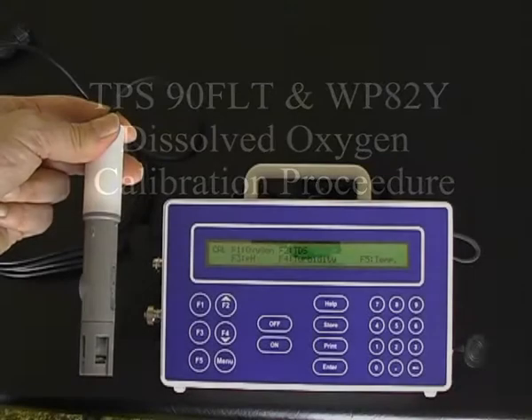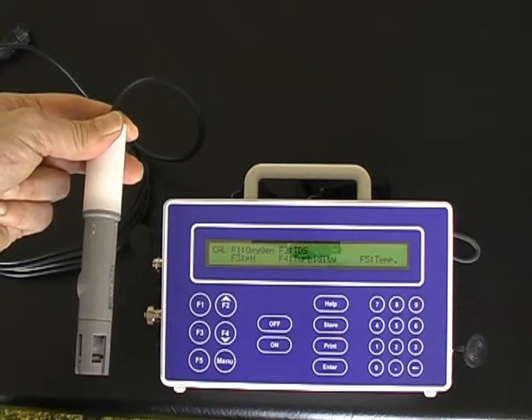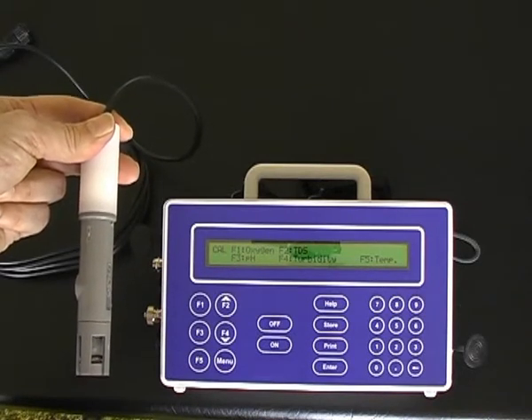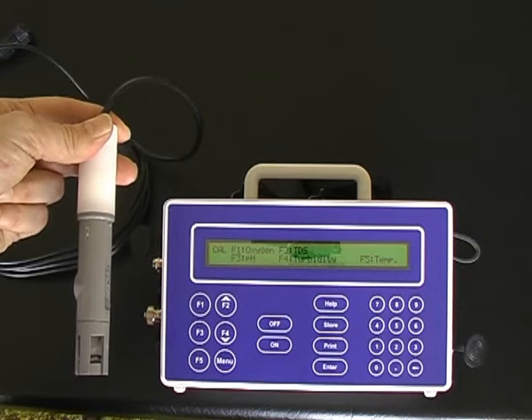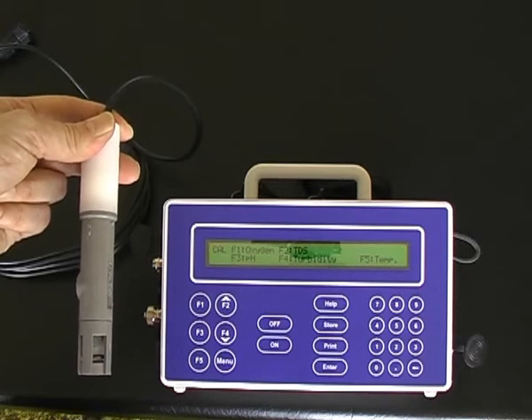Dissolved oxygen sensor calibration requires a two-point calibration: the first point in a sodium sulfite zero solution, and the second point with the dry sensor in air.